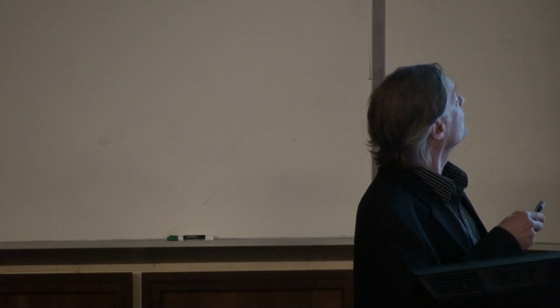So the binding energies that we'll be interested in for XPS, the definition of a binding energy, is actually the difference between the core level energy and the Fermi level. The Auger energies that we'll be looking at are basically the difference between the different levels in the atoms.